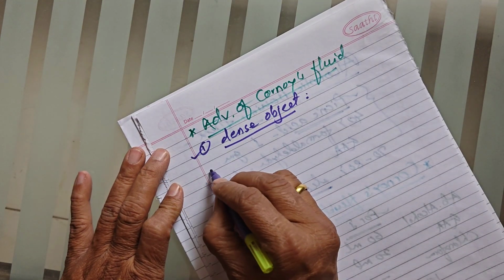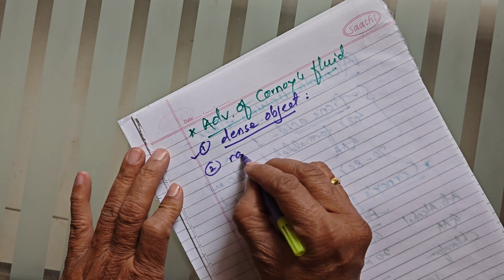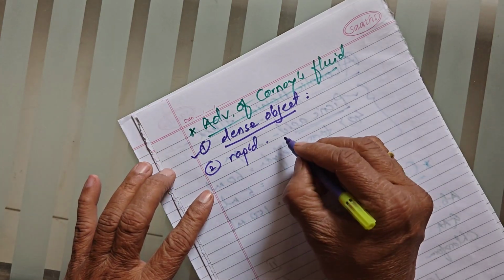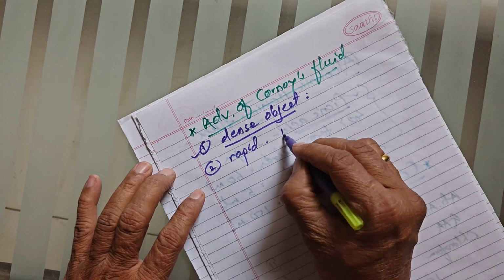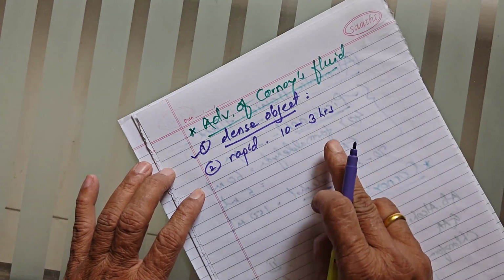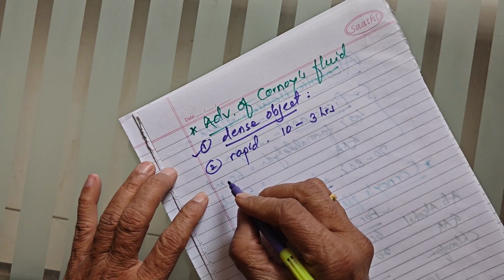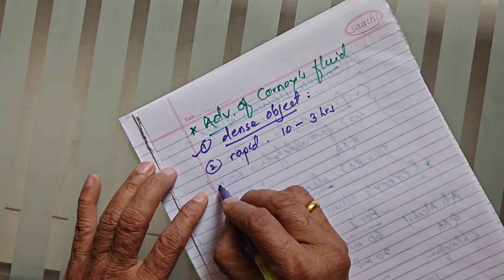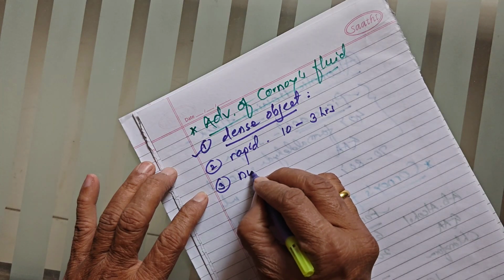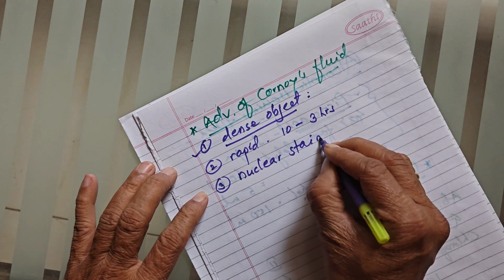The second advantage is that the fixation is very rapid, because as I told you before, the time of fixation is 10 minutes to 3 hours. As compared to Bouin's fluid, the fixation is rapid. The third advantage is that this fixative permits good nuclear staining.